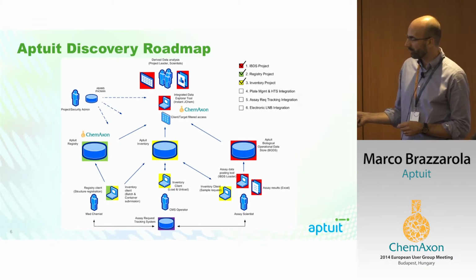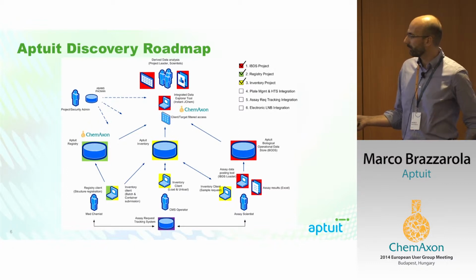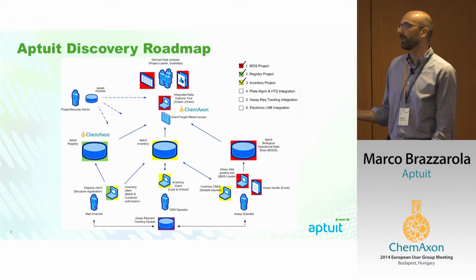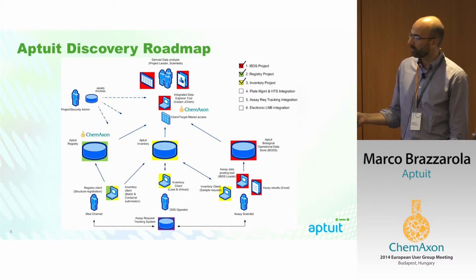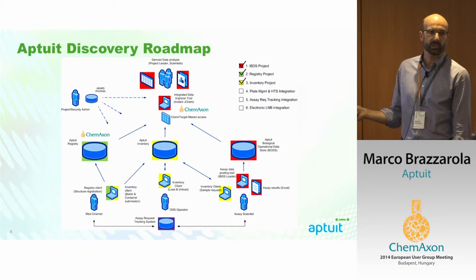All of this information, so structural information, batch and container level information, and operational biology information, are all pulled together into a visualization tool and layer, which is based on InstantJChem, that is available to analysts, project leaders, and scientists. In addition to this, we built our own set of tools and administration consoles to manage what is a fundamentally important element for a contract research organization, which is the access control and the project segregation.